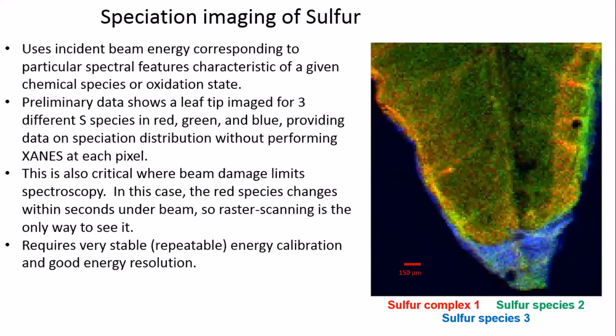So you either have to have a thicker window, or have the entire sample environment be vacuum. So that kind of prevented it, because we couldn't do either one of those. So we decided to go with the standard 45-degree geometry. We can move the fluorescence detector very close to the sample to get a fairly large solid angle.